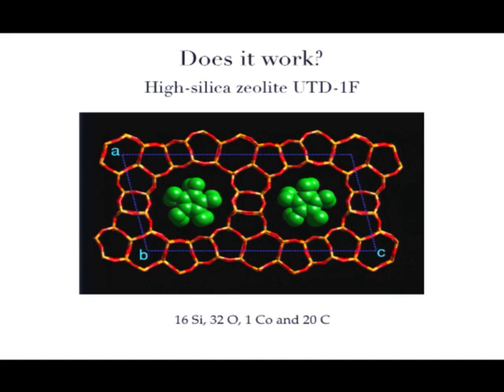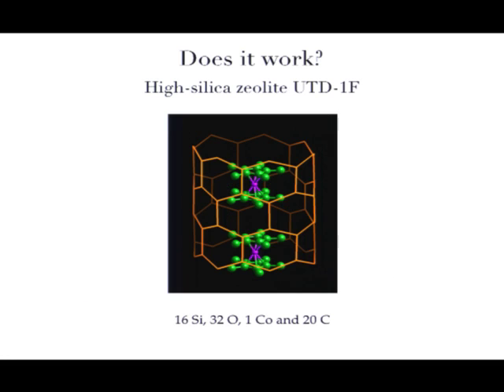And that's the solution we got. It's a nice zeolite with a template in it. It's a template in the channel, looks like that. And the structure solution was done by direct method. After deconvoluting the intensity, we have sort of quasi-single crystal reflection.